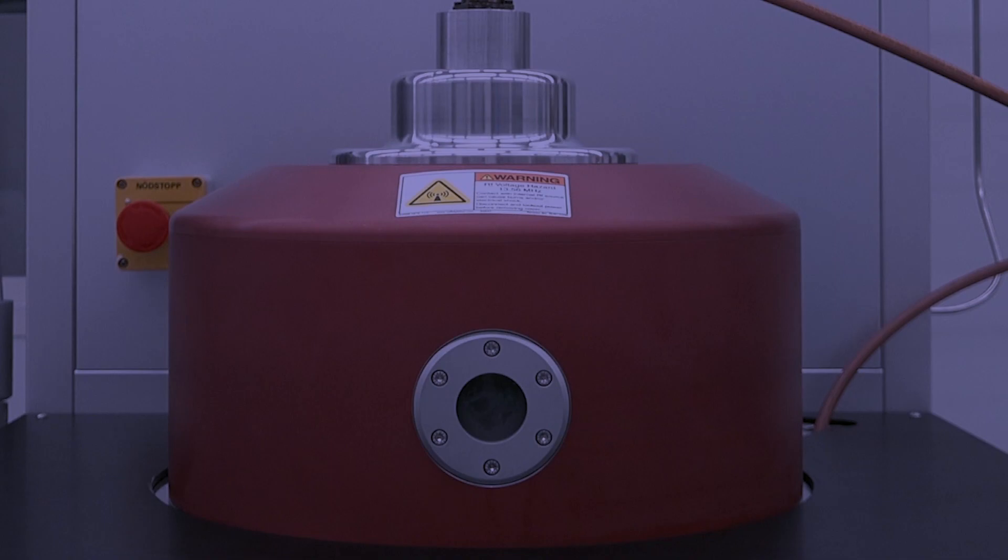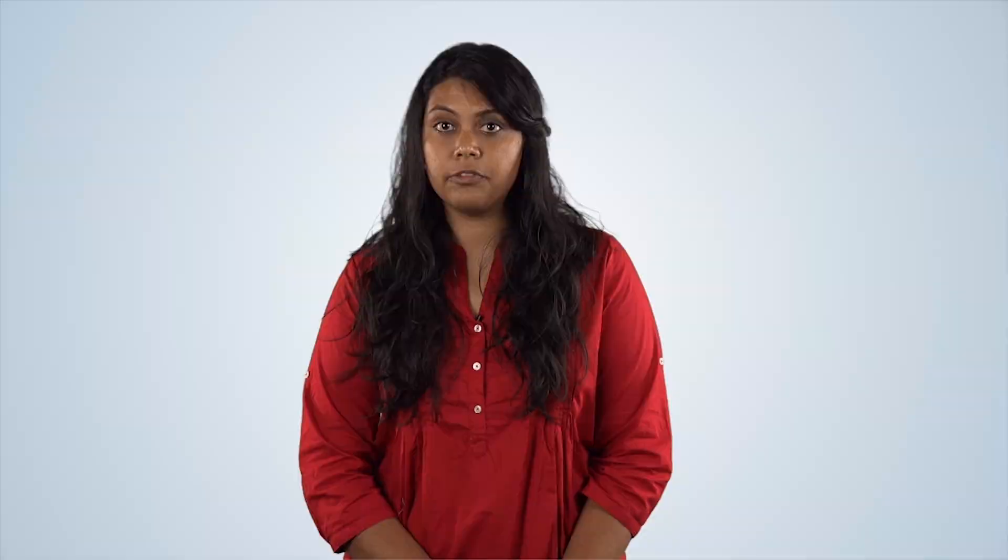PECVD deposition of silicon dioxide has now begun, and we can see faint glow of the plasma inside the chamber through this viewing window. After the desired deposition time is complete, the RF power and gas flow will be stopped by the computer.